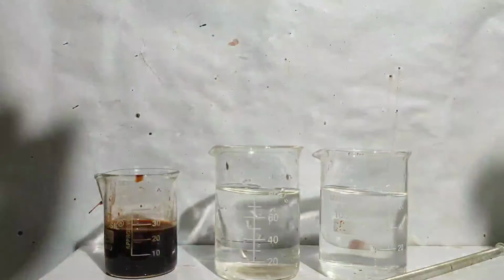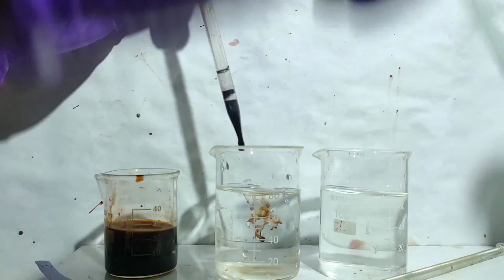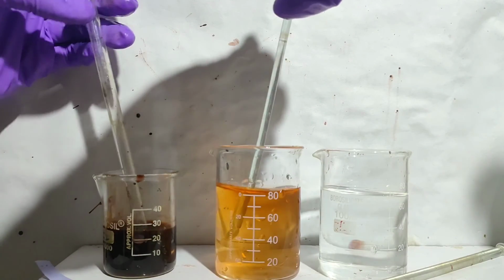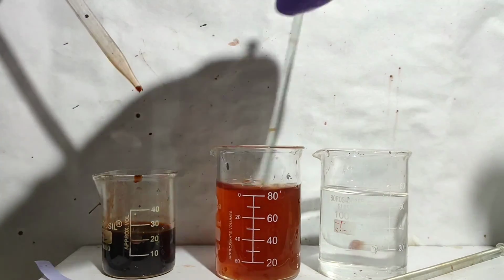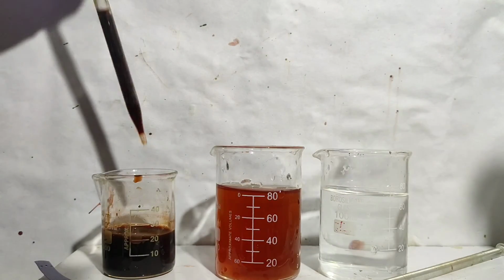Now I dissolved some Congo Red in water and as you can see, a dark red color is formed. In the first beaker, I have a dilute solution of sodium hydroxide and on the right I have a dilute solution of sulfuric acid. I added a few drops of Congo Red to these solutions.